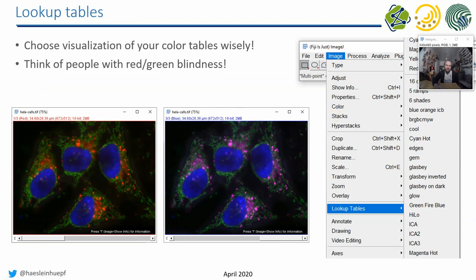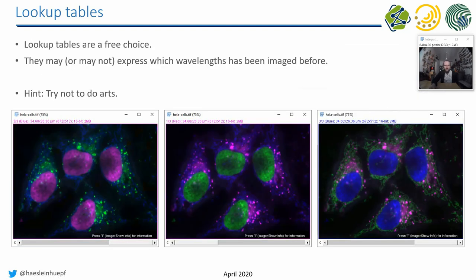Lookup tables are adjustable for visualization. To make images accessible for people with red-green color blindness, you should change the lookup table — for example from red to magenta — by selecting the channel and going to Image > Lookup Tables. Lookup tables are free of choice, but it's recommended to use ones related to your measurement. For instance, if you imaged an mCherry protein, use a reddish channel. Just try not to make it look like art.